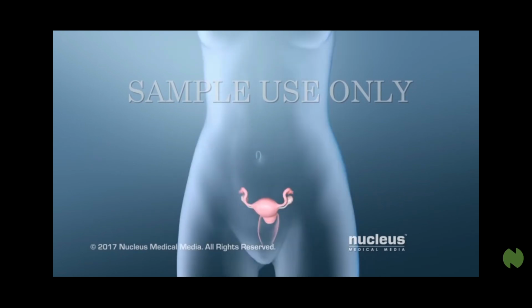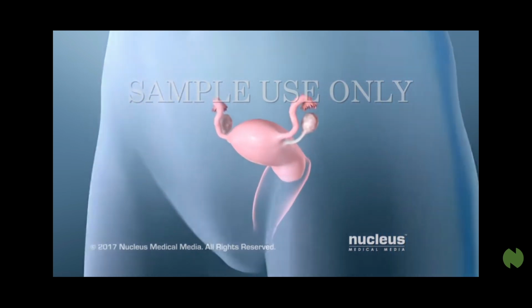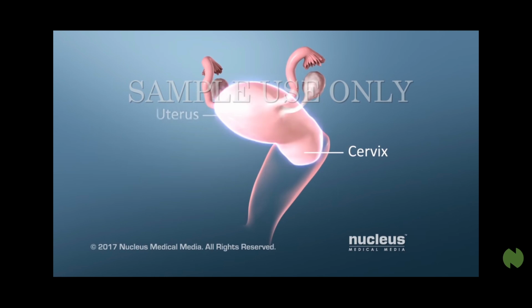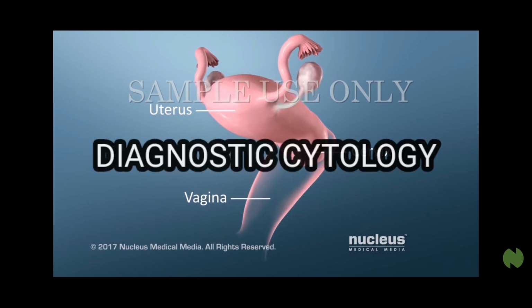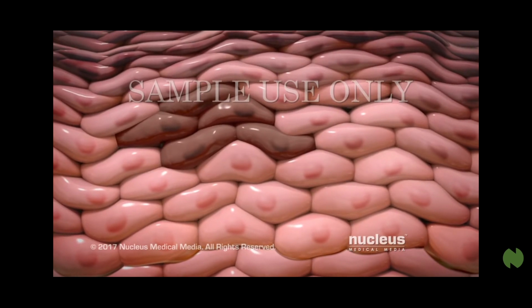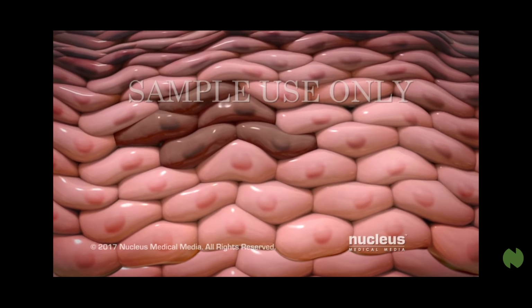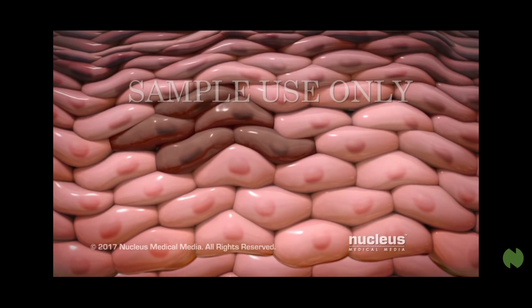Hi everyone! For today's topic, we will be discussing the Papanicolaou staining technique. But before that, I want you to know that the Papanicolaou stain, or the Pap staining method, is under the big umbrella of Diagnostic Cytology. Under Diagnostic Cytology, it also belongs under Exfoliative Cytology. So let's first differentiate what diagnostic cytology and exfoliative cytology mean.